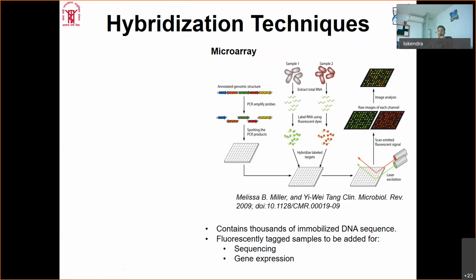So this is one way of looking at gene expression profiling as well as sequencing. Microarray is also one of the methods of sequencing, although it is not very much used nowadays for sequencing. But for gene expression, people still use microarray data as one of the authenticated methods.